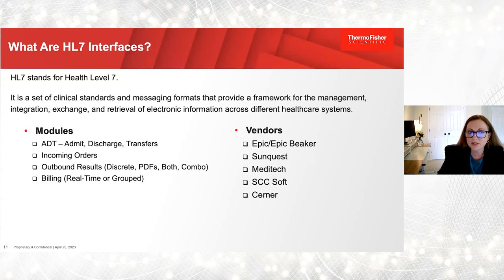HL7 interfaces, so this is where we get into those hospital interfaces between your Epics, your Meditechs, your Cerners. We have ADT, incoming orders, outbound results, and billing. So ADT is from your registration system. Incoming orders is what your clinician wanted you to perform. Result is the result of that order, either via discrete data or PDFs, and then also billing.